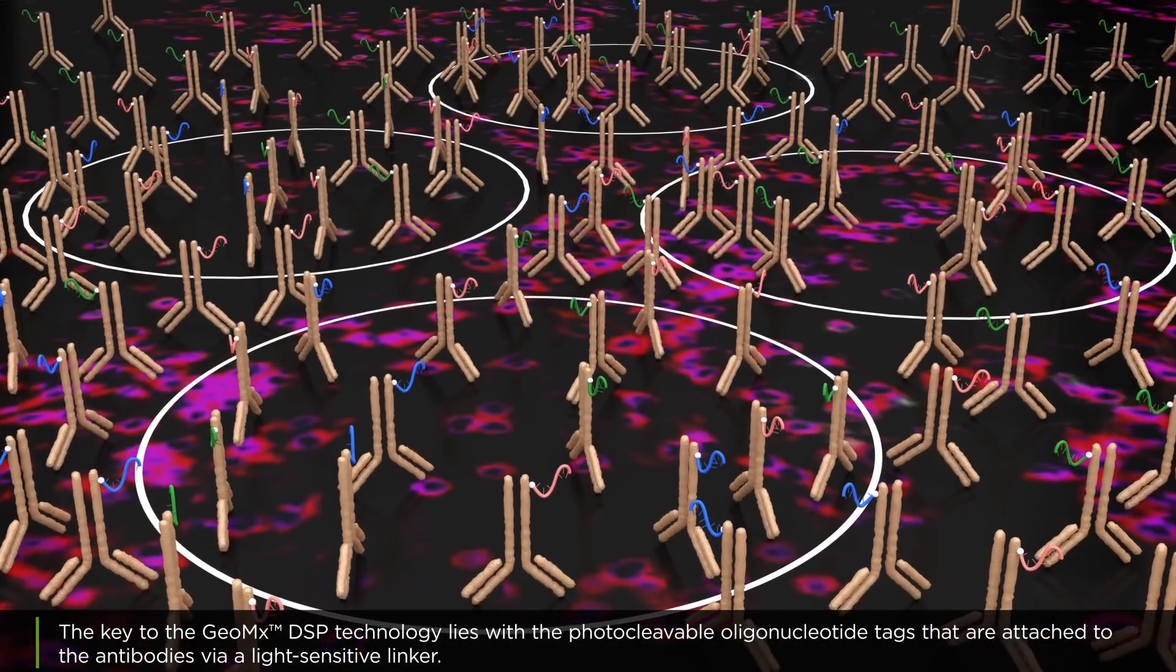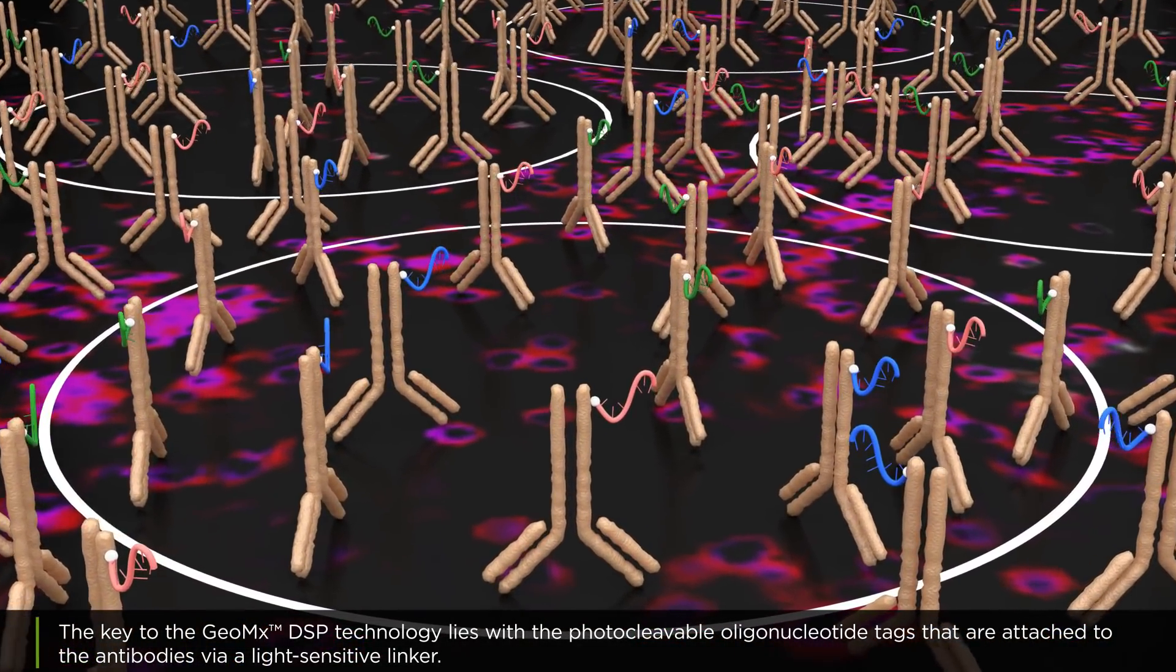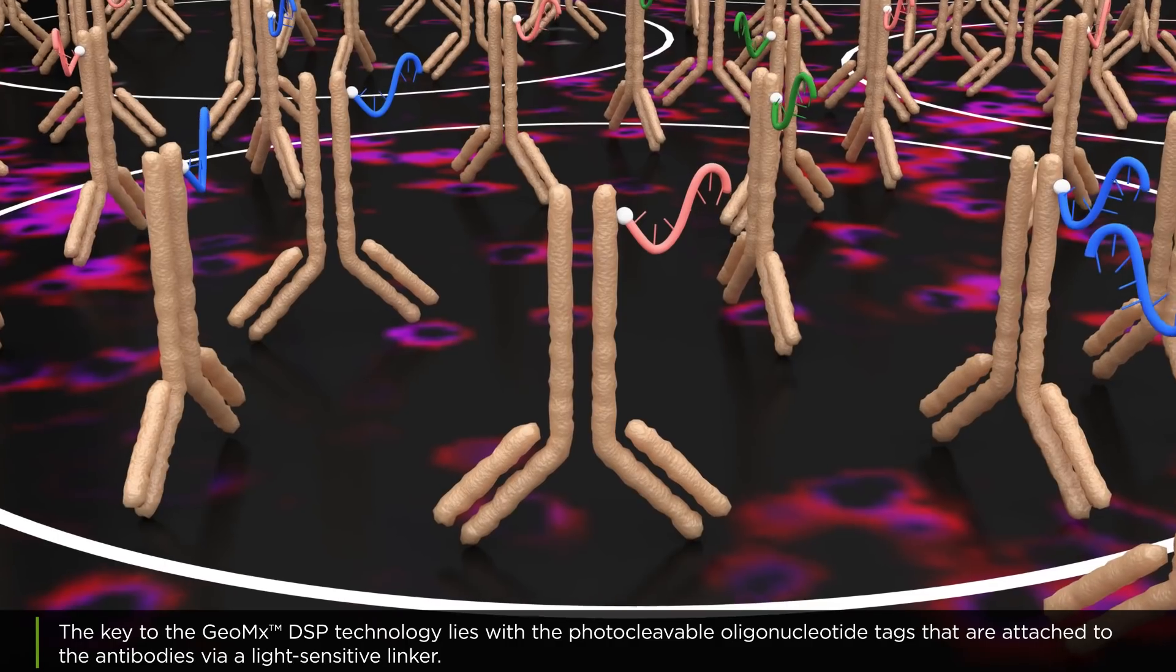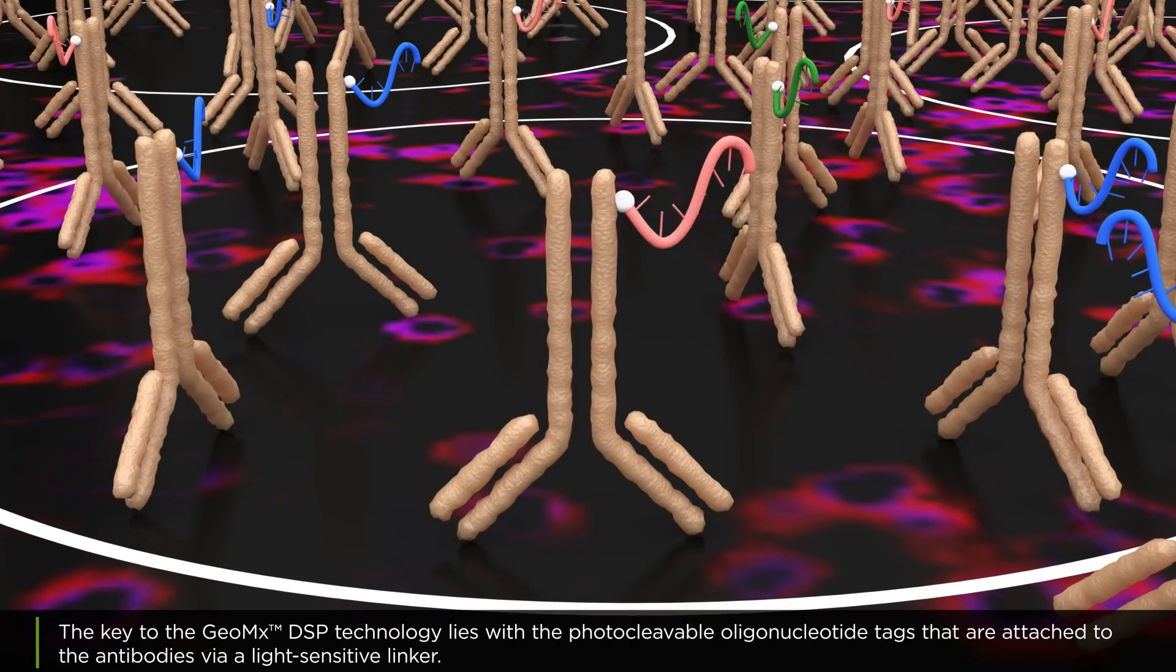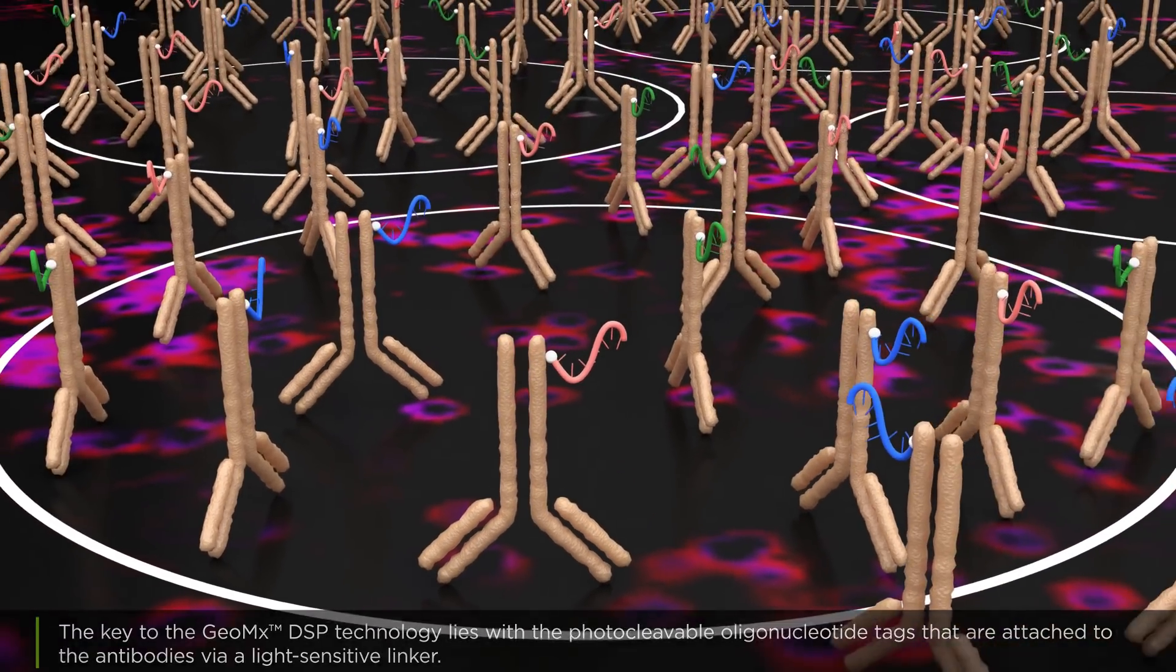The key to the GeoMix DSP technology lies with the photocleavable oligonucleotide tags that are attached to the antibodies via a light-sensitive linker.